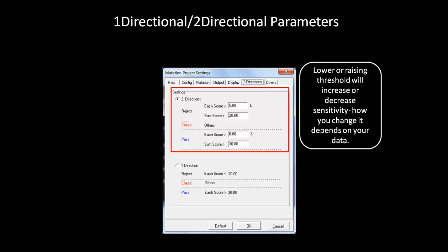The threshold can be lowered for increased sensitivity, but you could pick up more false positives in your samples. The settings for a particular data set may vary for optimal mutation calls. The third option is to analyze both 1D and 2D data under one directional parameters. With this option, you are more confident that no mutation will be missed in your 1D samples. However, this may introduce false positives into your project due to the high sensitivity. Another option would be to switch back and forth between 1D and 2D parameters when reviewing each individual mutation.